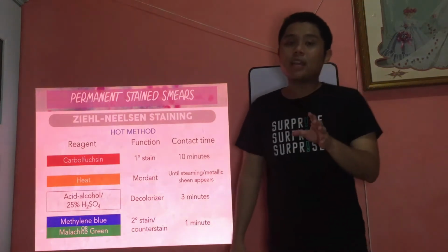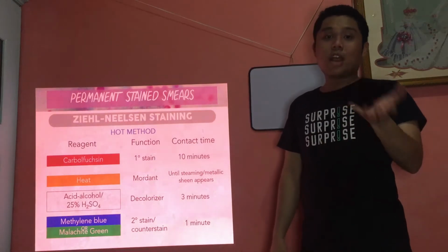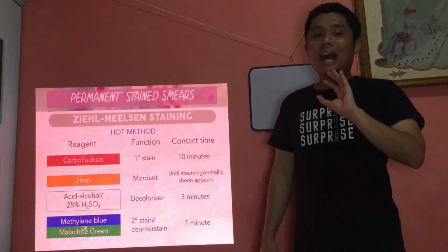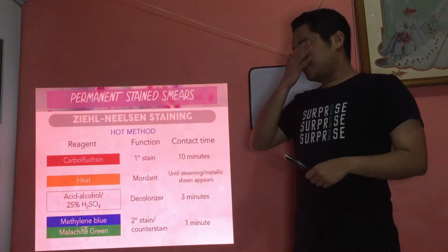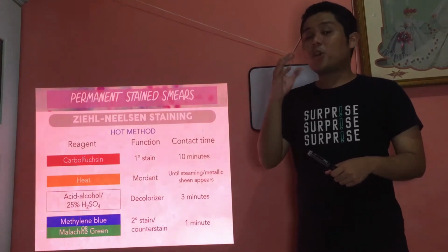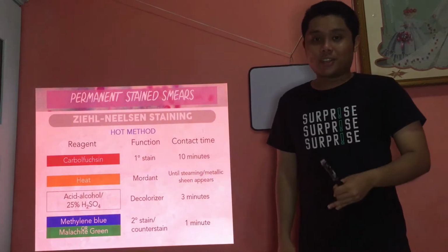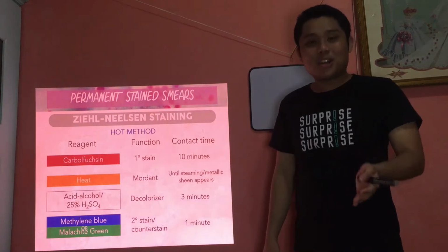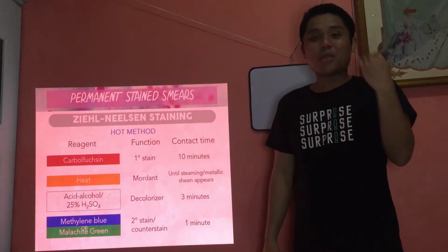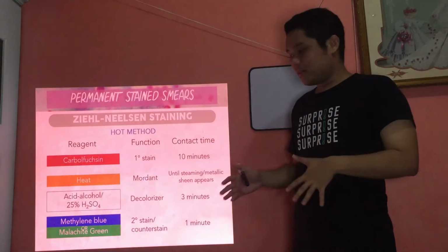Now we have different reagents. For differential staining, especially gram staining and acid-fast staining, we have additional reagents aside from the stain. The reagents I'm going to emphasize are number 1, the mordant, and number 2, the decolorizer. It was already mentioned in the Tompkins-Miller method for iron hematoxylin. So I mentioned I will discuss it now.